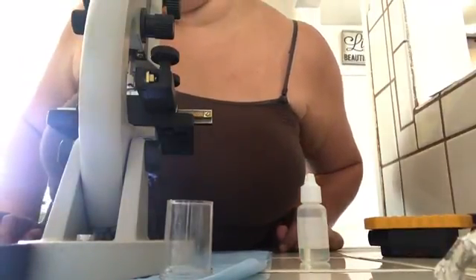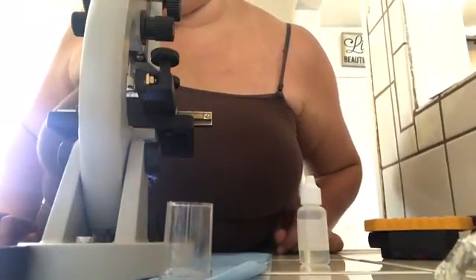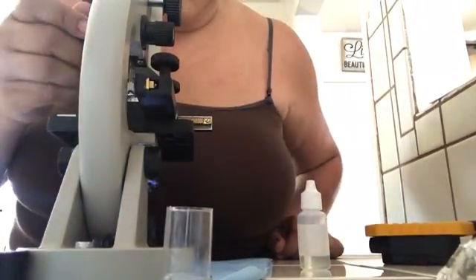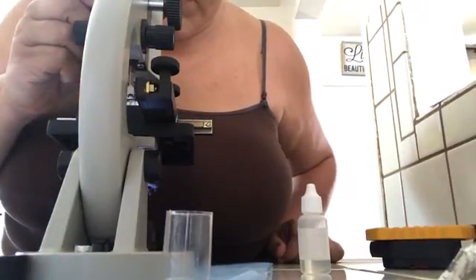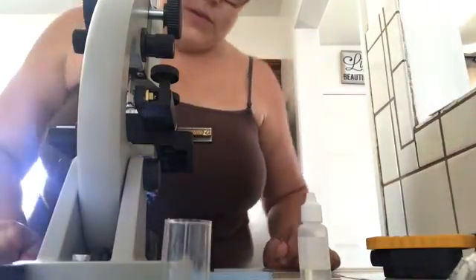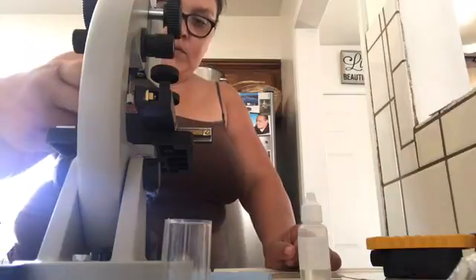So now we're moving on to the yeast, and I am focusing it on, which color is this? This is 10. So that would be the low power. I'm going to switch it up a little bit to the next level.